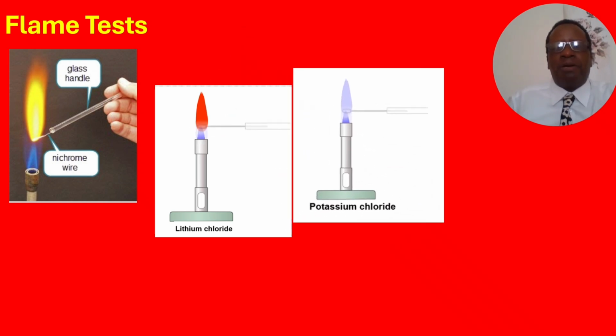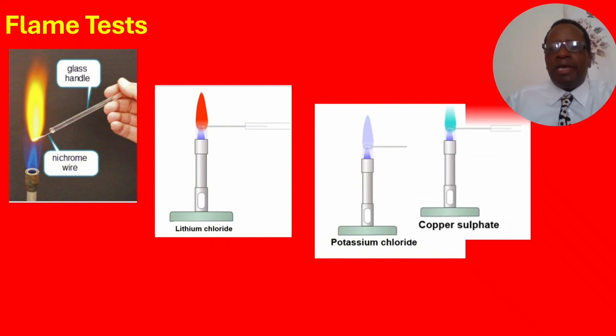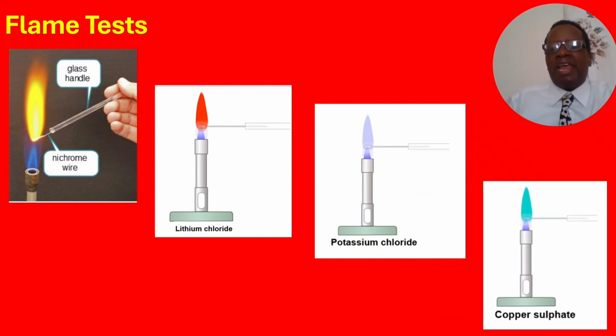If it is potassium, it's going to burn with a lilac flame. And if it's copper, it's going to burn with a green flame.